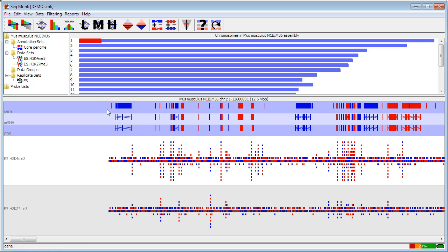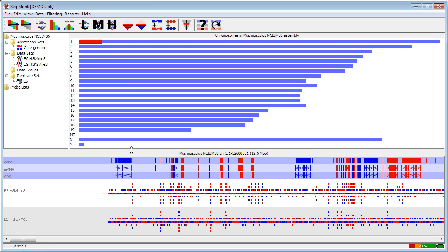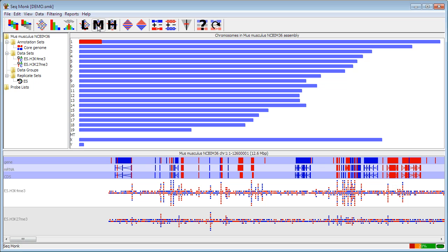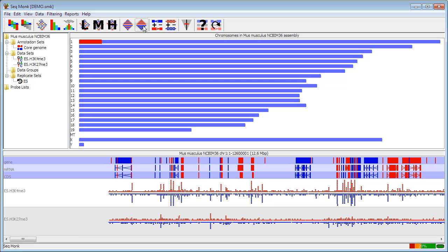I can change the density with which my reads are showing. So if I had a small window where I'd saturated the display available I could move from a low density to a medium density to a high density display to show more reads. And also at the top I can choose to change the default which is to pack forward and reverse reads together to split them apart so that I can see them separately.